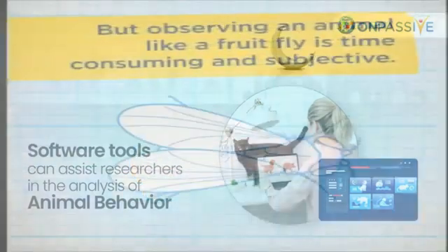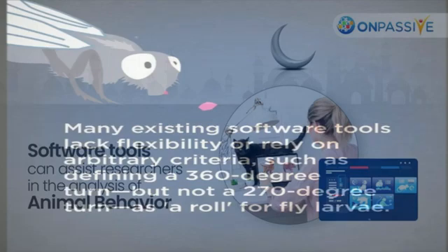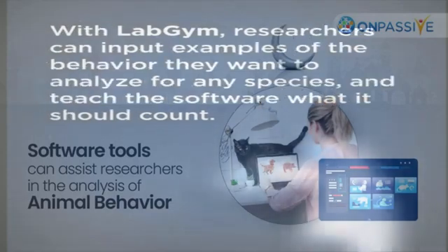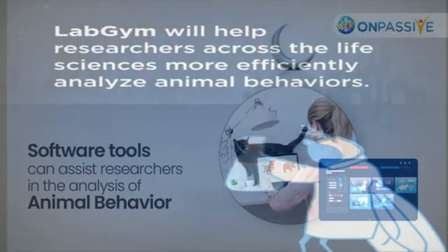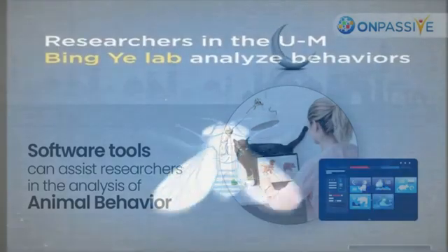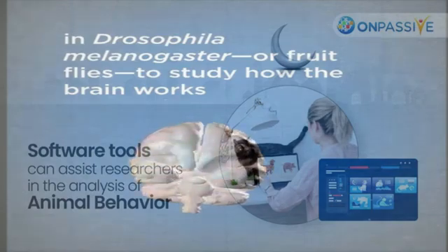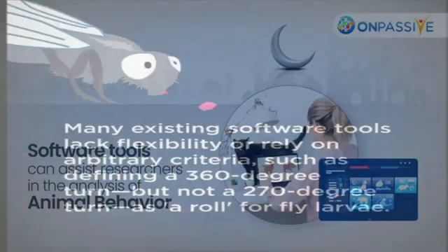The use of both video data and a so-called pattern image to increase the program's reliability is one new feature in LabGym that allows it to use this more flexible cognition. Scientists utilize recordings of animals to study their behavior, but movies contain time series data that AI programs may struggle with. Hu generated a still image that displays the pattern of the animal's movement by integrating outlines of the animal's position at multiple time points to help the computer recognize actions more quickly.